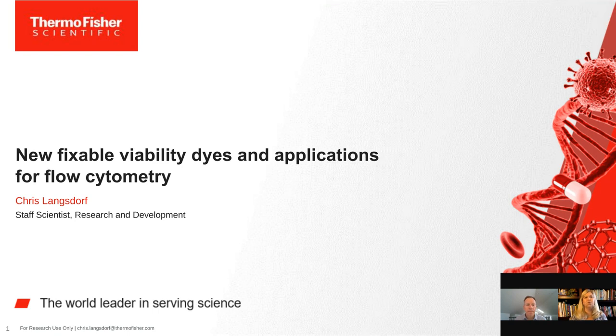But Chris, did you want to talk a little bit about that slide? Maybe provide some information for that audience member? Yeah, definitely. So in regards to the fact that there are now 14 different dyes, there are a lot of details as far as excitation and emission and where these fit into your instrument.